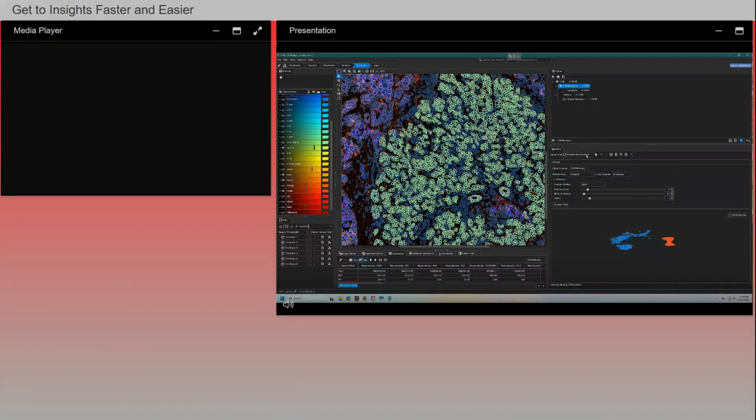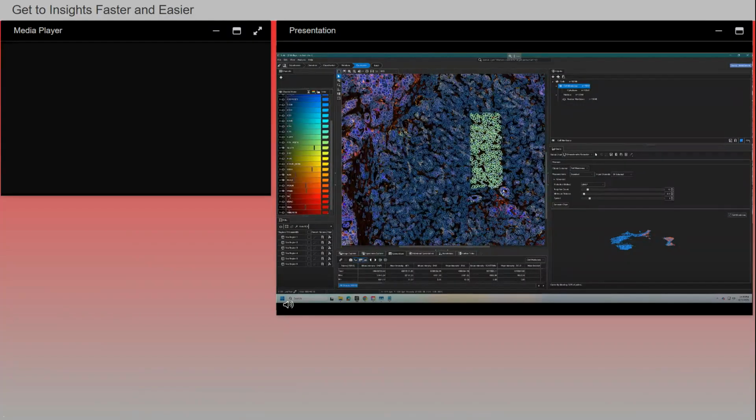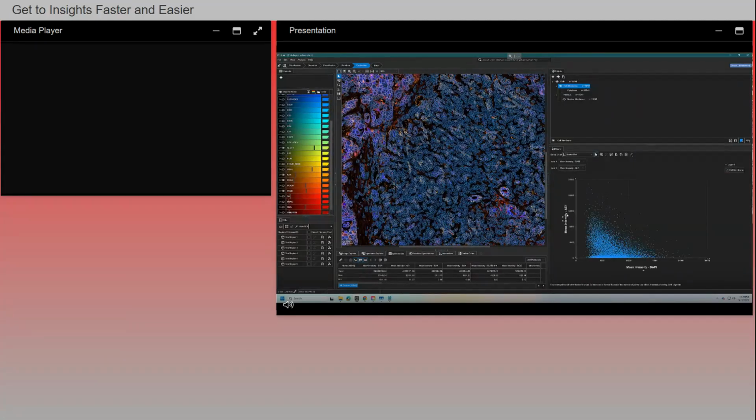Another option that I have is, first of all, I'm going to get out of this option. So I'm going to select to get out. Then another option is to have a scatter plot, where this is the cool way to actually flip through different measurements that I was showing to you, so you can explore your data very actively, rapidly, to get insights.